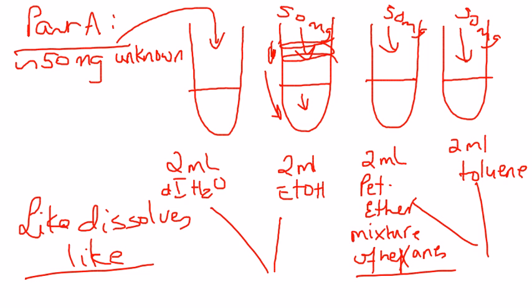Now, also, if I were you, I would use the 6-inch test tubes because you have to heat these test tubes, and you really don't want to have the solvent boil over. We never want to do that. So make sure that you use the medium-sized test tubes, not the small ones. Now, what do we do next?